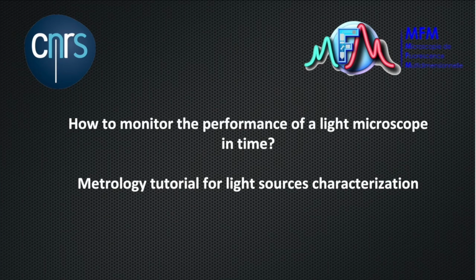How to monitor the performance of a light microscope in time. Metrology tutorial for light sources characterization. To obtain reproducible data, the light sources represent one crucial element that can be monitored easily.